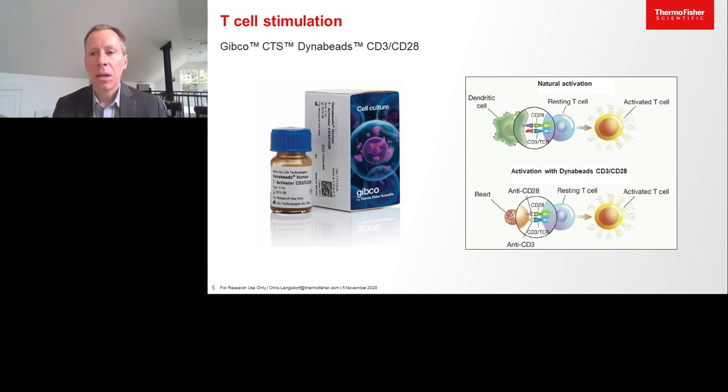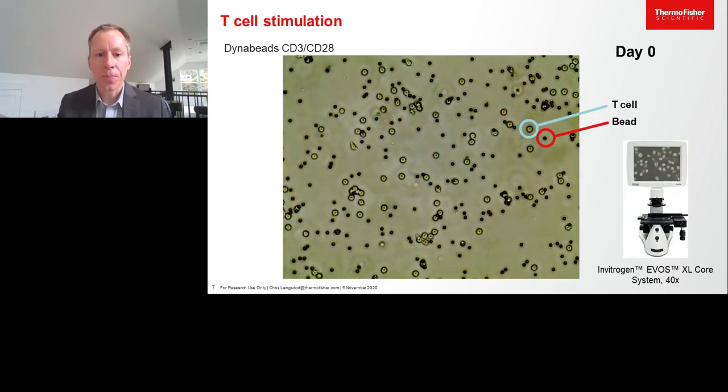by means of CD3 antibody providing a stimulatory signal and CD28 providing the co-stimulatory signal, encouraging a robust proliferation of our T cells. And so let me show you what this actually looks like in a culture dish.